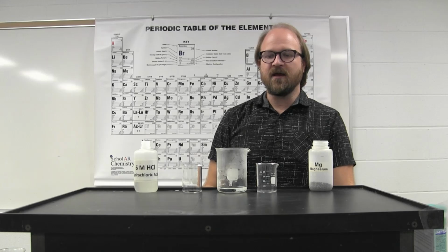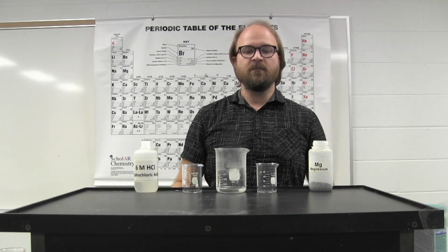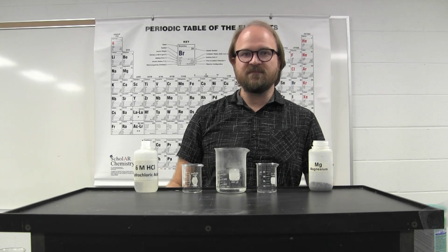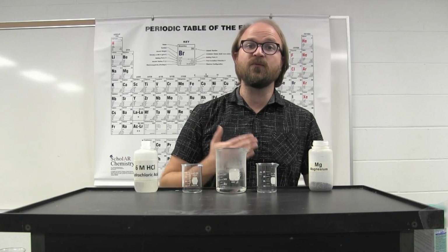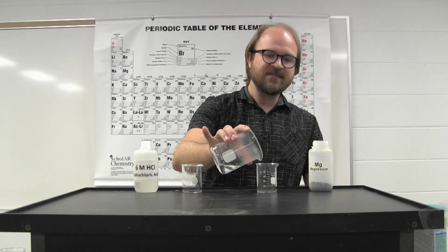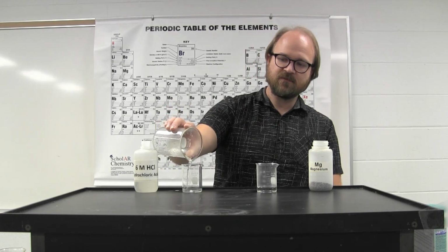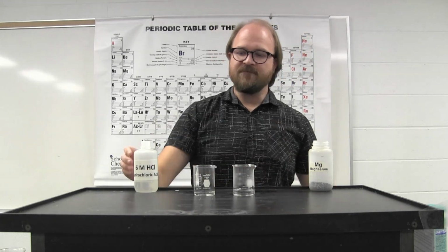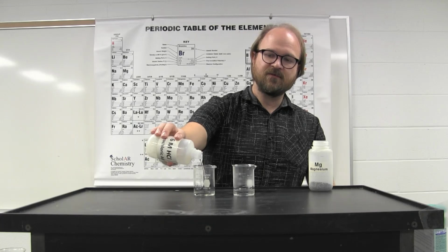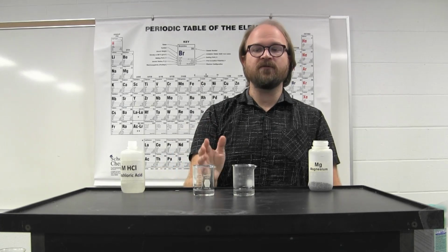But experimentally, you can also do that. The reaction is now complete, everything is used up, the limiting reagent is gone. But if there's any excess material, it can still react if the limiting reagent is reintroduced. So if I split this up into two portions, if I add more hydrochloric acid, nothing happens. There is no further reaction.